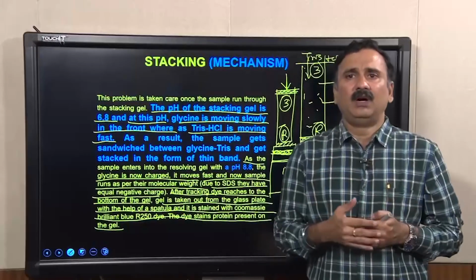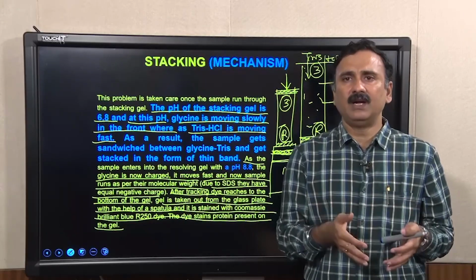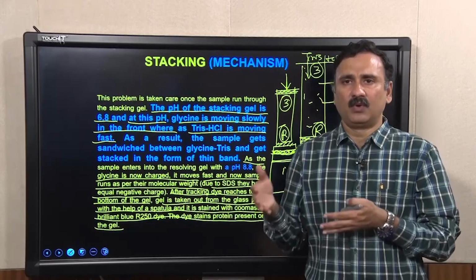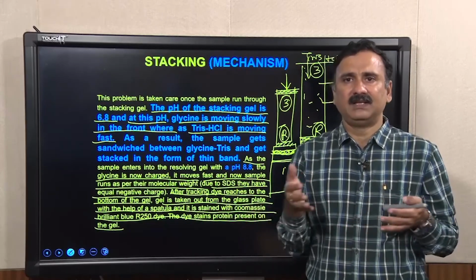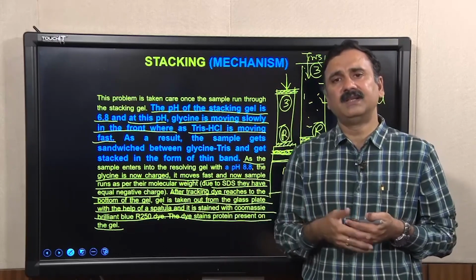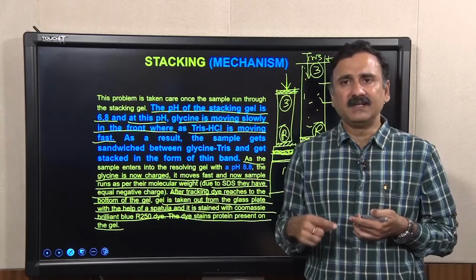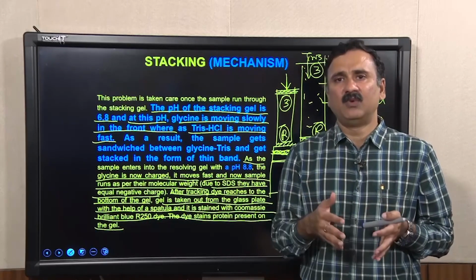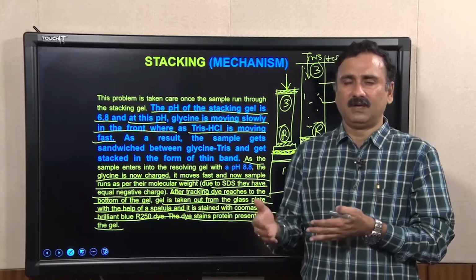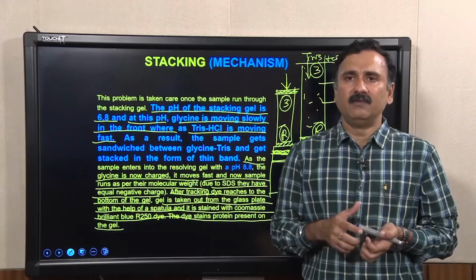With this demo, we have shown you the different steps required to prepare the acrylamide solutions, and then how to prepare the resolving gel and the stacking gel, how to load the samples, and then how to perform the electrophoresis, and ultimately how to do the staining and destaining. I hope that this demo video could be helpful to understand vertical gel electrophoresis. With this, we would like to conclude our lecture here.